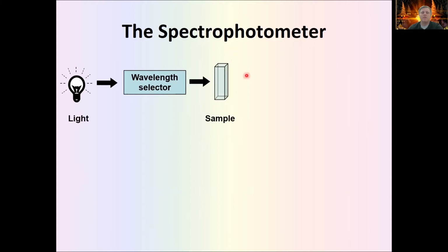Most spectrophotometers use a simple cuvette for this. And we'll talk a little bit more about cuvettes as you go through the labs. So for one lab, we're going to use a plastic cuvette. And the other one, we're going to use a quartz crystal cuvette. The difference there is the plastic and quartz crystal both transmit visible light, but the plastic ones actually absorb UV light. And so you can't see UV light when you're trying to measure at that wavelength for different samples.